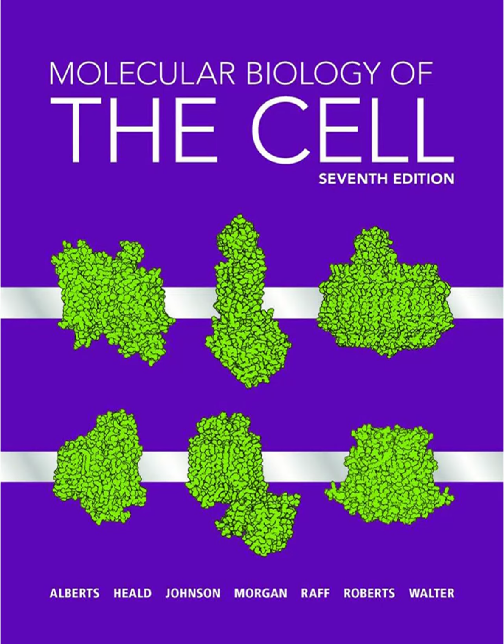Cool effect. What else? Then you have phase contrast and DIC, that's differential interference contrast. These are really clever. How do they work? They exploit tiny differences in refractive index within the cell. Basically, as light passes through denser parts like the nucleus, it slows down slightly compared to light passing through the watery cytoplasm. Like the running through mud analogy earlier.